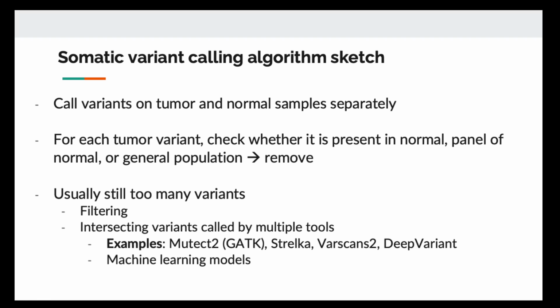And a lot of people suggest doing variant calling with multiple tools. With the GATK pipeline that we mentioned, the software called Mutect2 calls the somatic variants. Other software are named like Strelka. These use similar algorithms, but different parameters, or slightly different filters. So people usually run the sequencing data through multiple software and then take the intersection. Any mutation that is called by these software together will be higher confidence, so we are more sure that it's actually present in the tumor.